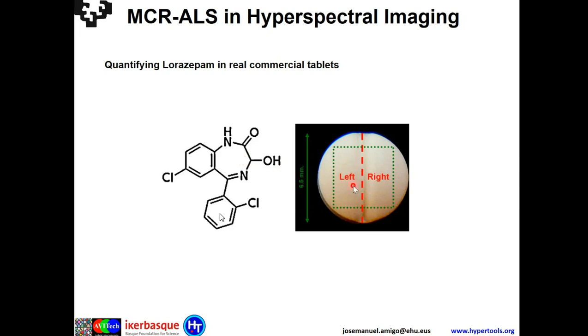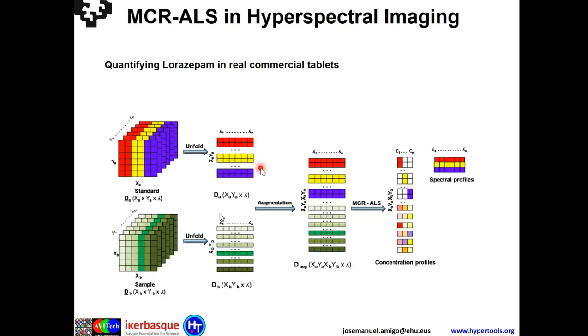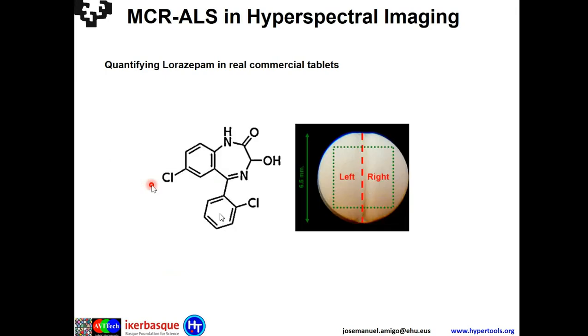So actually, many times when you go to the doctor says you have to take half of it. And one of the questions that came to us is that, okay, if you take half of the tablet, you will have half of the active principal ingredient in that half, or the distribution here is not really homogeneous. Okay, so we wanted to investigate that question, and what we did basically is to create our tablets in the lab. Okay, by using compression forces, we could create tablets with different concentrations of compounds, including lorazepam.